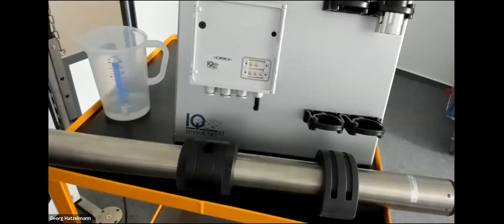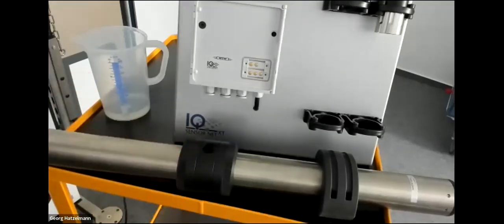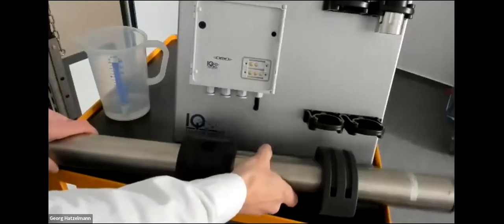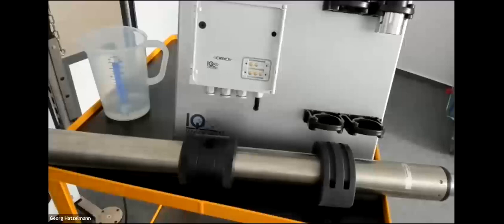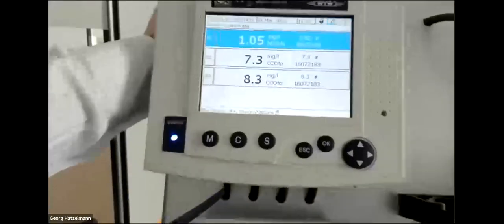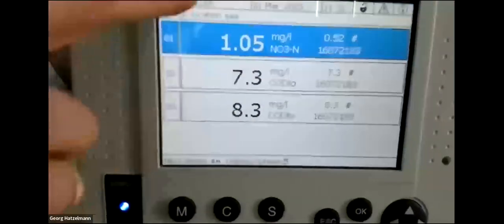And before I start on the system, I want to explain, when you have filled it, you should knock carefully to remove air bubbles. And now back to the system on the screen to see what you can do on the screen. Okay. Always the problem with adjusting the camera, of course. Okay, so if I want to check the sensor, you have to select it.